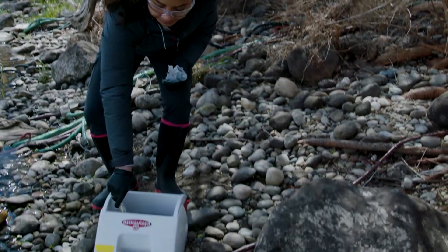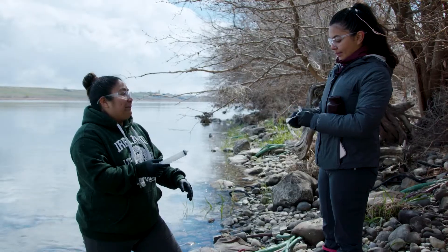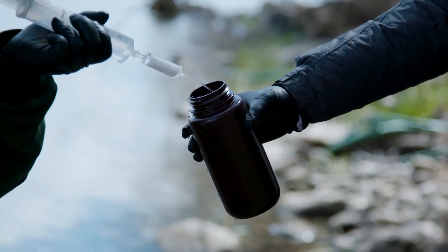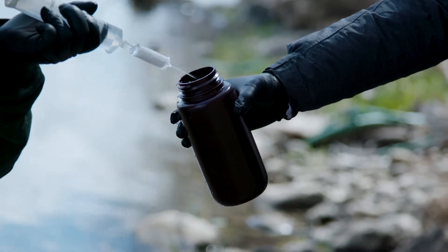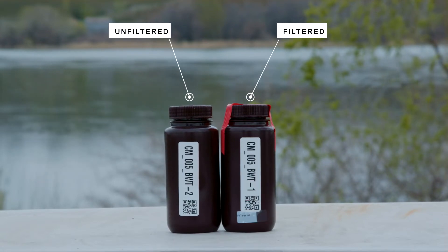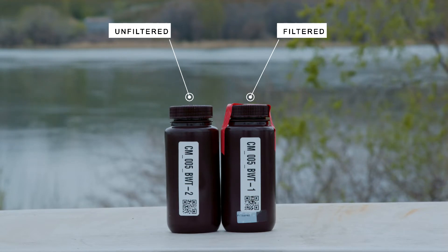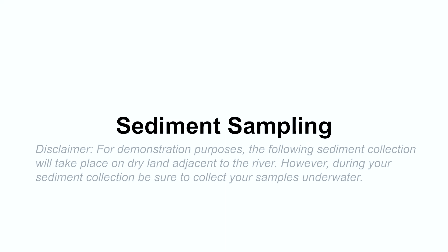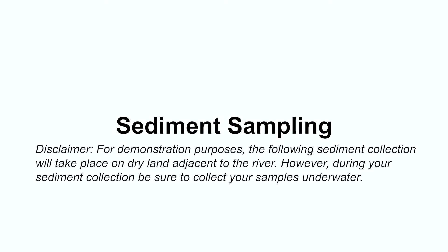After your filter is preserved, attach a new filter to finish your filtered water sampling. Once you have filled the opaque brown plastic bottle labeled for filtered water, you will fill a bottle with unfiltered water. Find the bottle labeled BWT that lacks a label for filtered. Fill the bottle from approximately 50% water column depth, fill to the neck and close, then store in the cooler with the other samples. Now that you have finished collecting water samples and the filter, you can move on to collecting sediment. For demonstration purposes, the following sediment collection will take place on dry land adjacent to the river; however, during your sediment collection, be sure to collect your samples underwater.